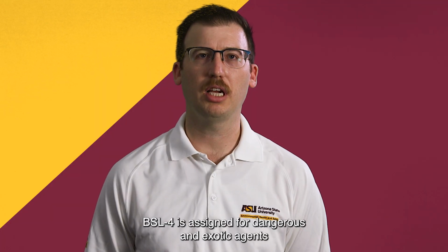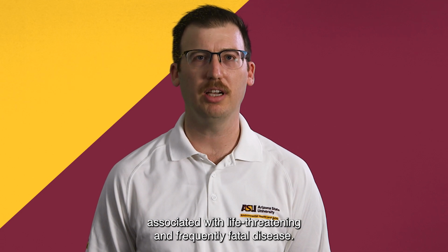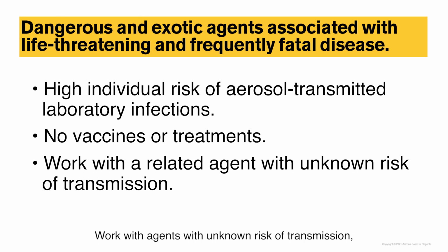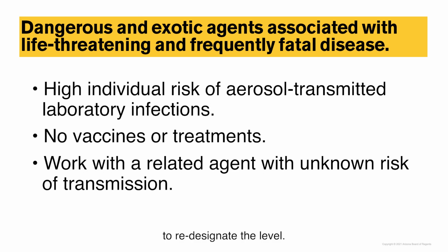BSL-4 is assigned for dangerous and exotic agents associated with life-threatening and frequently fatal disease. There is high individual risk of aerosol-transmitted laboratory infections, and there are no vaccines or treatments available. Work with agents with unknown risk of transmission but known relation to a BSL-4 agent are conducted at this level until sufficient data is obtained to redesignate the level. There is not a BSL-4 facility on campus.